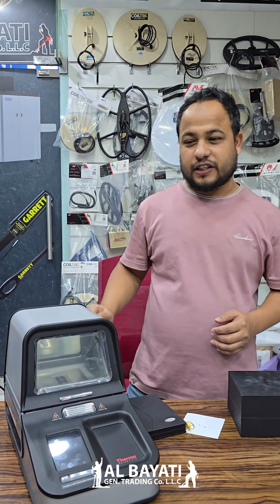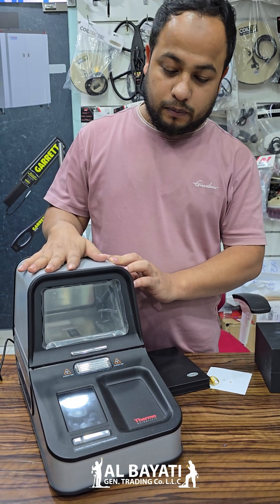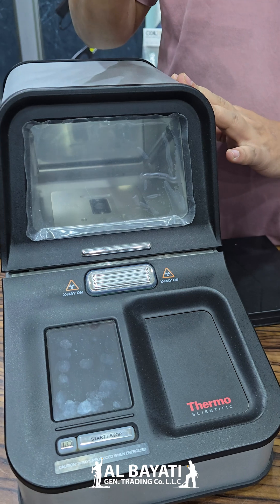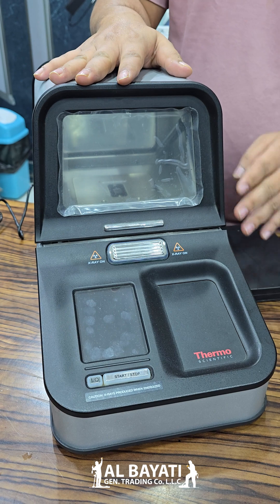Assalamu alaikum, this is Seir Mustahim from Al-Baiyati General Trading LLC. This print from Thermo Scientific. If you have good business, you must need this one. This mini lab is like the same. This name Thermo Scientific DXL.